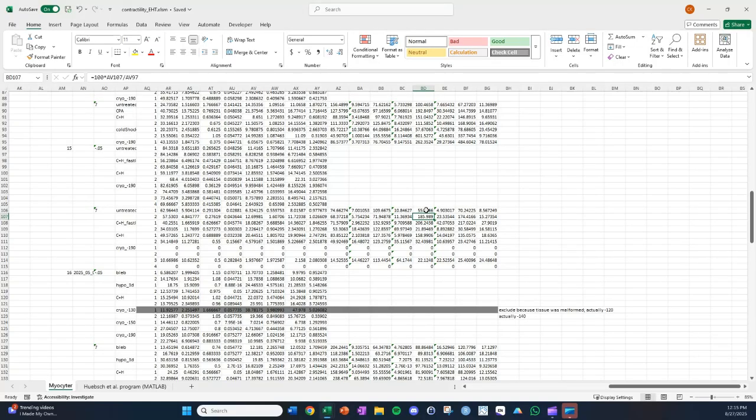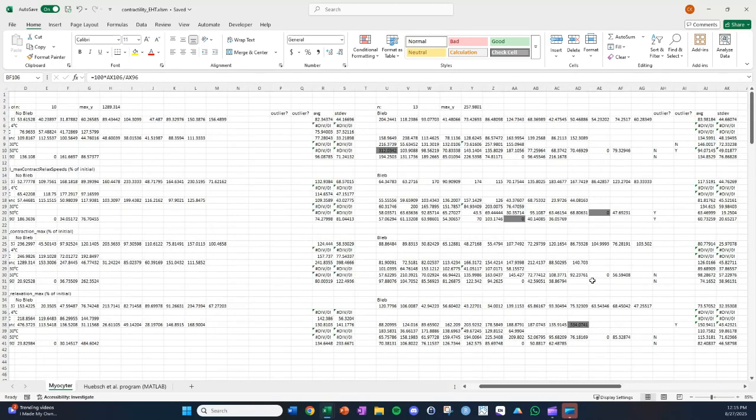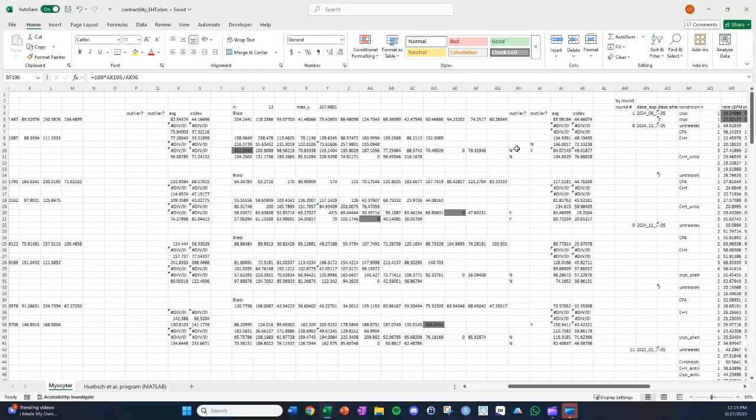The way I think about strong beating is in terms of power, power in watts, like force times speed, and this is of course one of the two components of that power, the speed component, which in summing up my data tends to increase over time. But yeah, this variability is why replicates are important, and with a lot of replicates, it does give you enough ability to do outlier tests. So I'll just show some of that there.